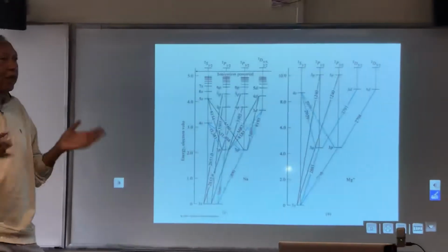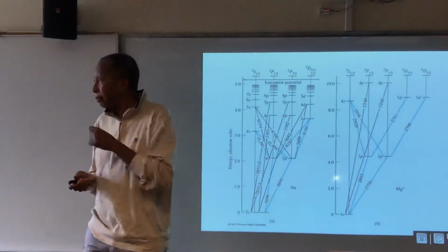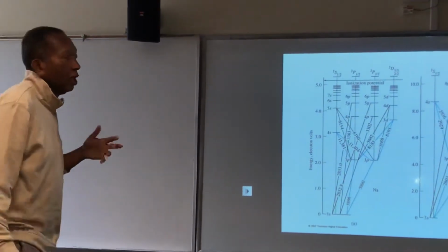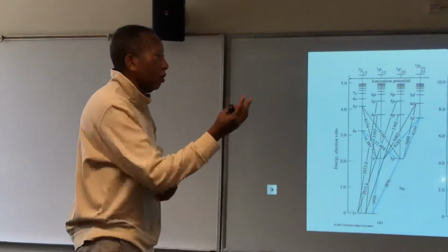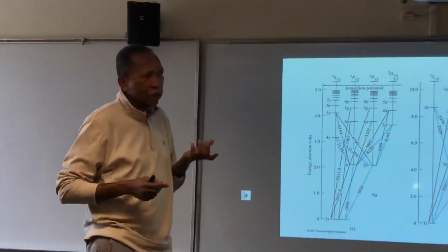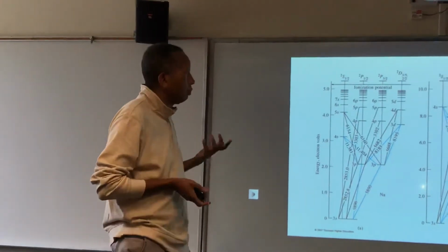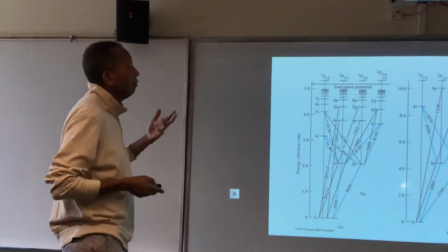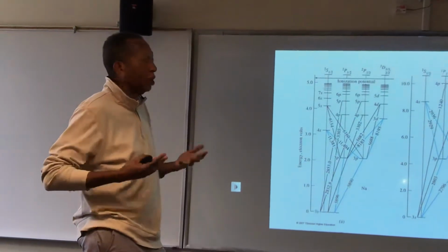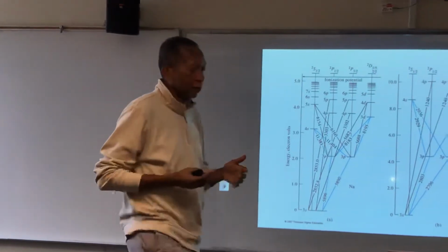a different design of the instrument, because Beer's law requires that the bandwidth of the source must be narrower than the absorption bandwidth. And that was easy to achieve in molecular spectroscopy. So the bandwidth was 40 nanometers, the effective bandwidth. So as long as the wavelength selector can give us less than 40 nanometers, let's say 10 nanometers, it was fine. But with these narrow bandwidths, we have to change how we get the source to be narrower than the bandwidth of the transition here. All right, and that's what drives all of the instrumentation.